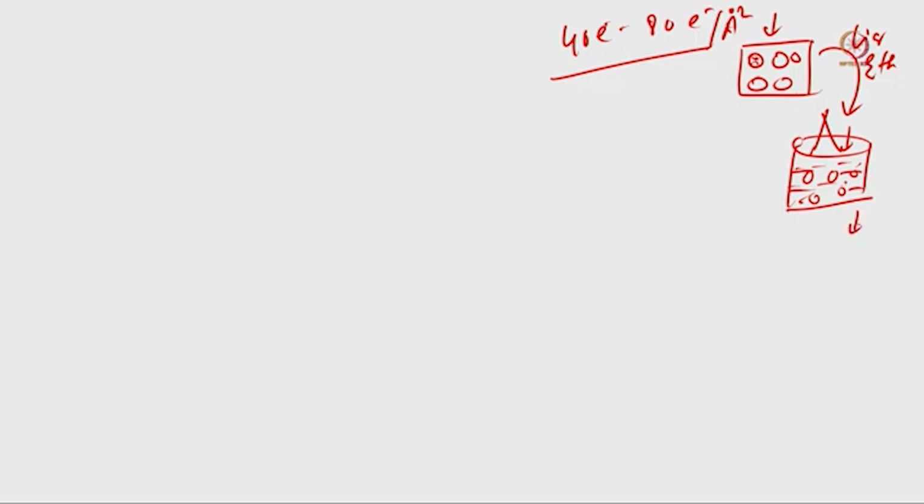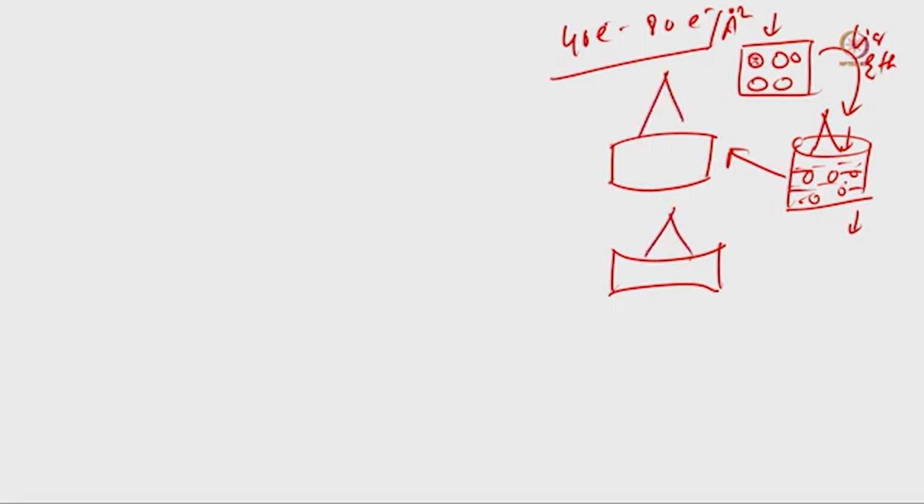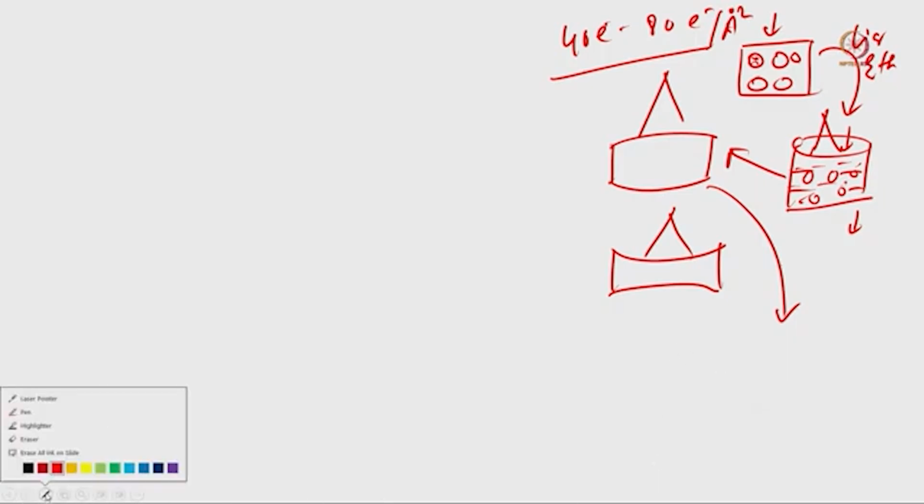That will come back and we will discuss. Not only that, there are 2-3 possibilities I already explained, okay, where ice can form like that. Or if we just look at this one, ice can form like that, right. Now the electron beam is going through this sample. Because of this heat energy, or the huge amount of energy transfer that is happening, there is a possibility of a change in the ice pattern. What kind of change are we expecting in the ice pattern?